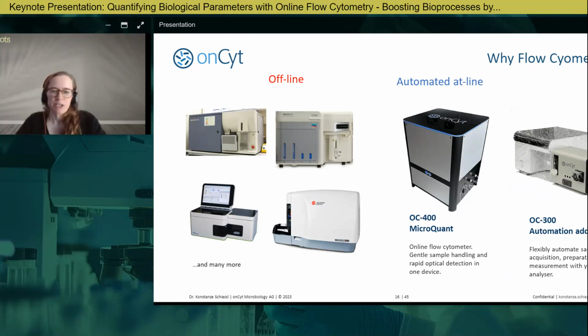Okay, and then there are many, many machines out there. So there are many offline machines, like really, really many. I just put a couple here. And if you ever worked in a lab, I'm kind of sure you already came across flow cytometers, and they can be huge with hundreds of lasers and detectors and so on.